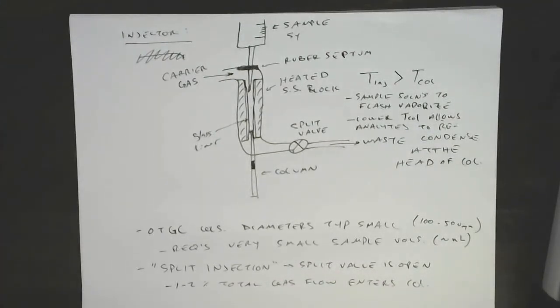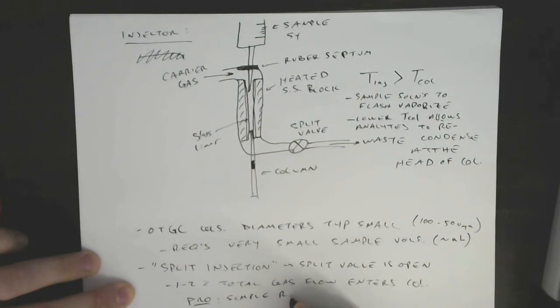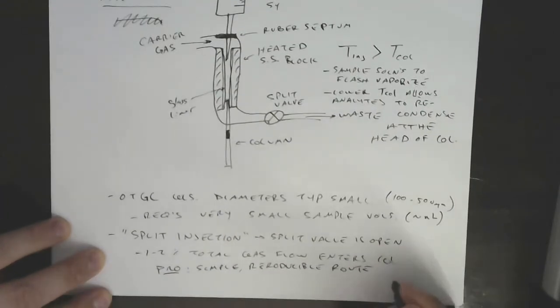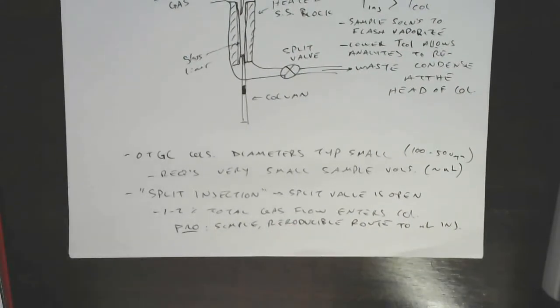So there's a pro and a con here, right? So the pro is that this is a simple and reproducible route to nanoliter volume injections, right? It's a simple route to nanoliter injections.